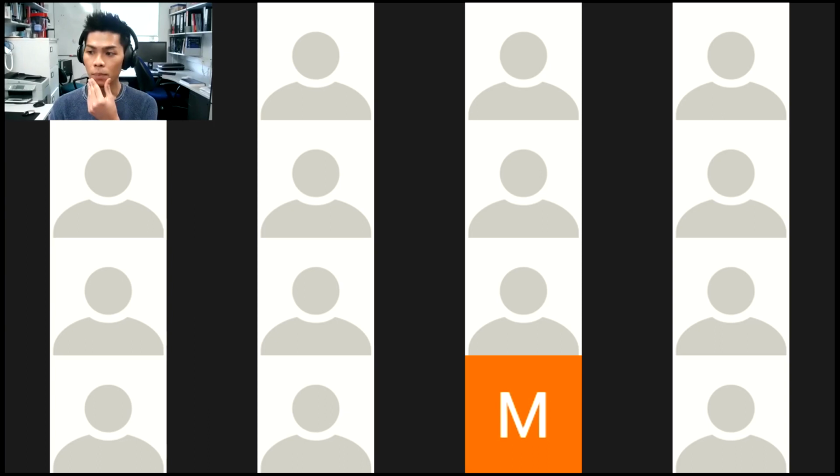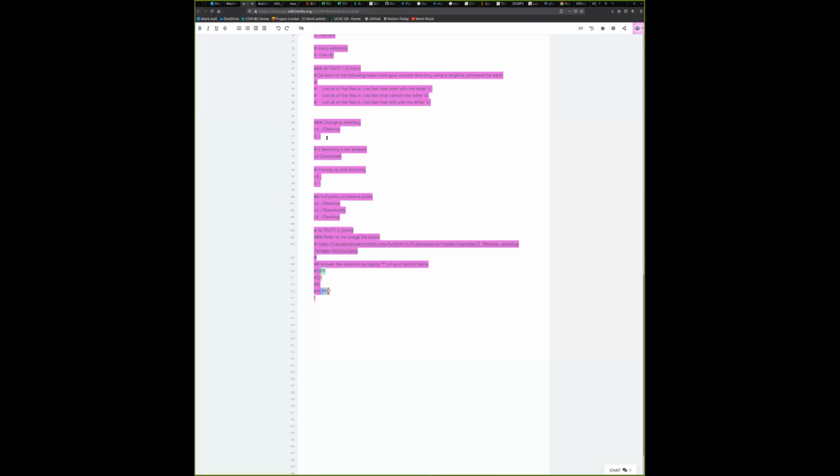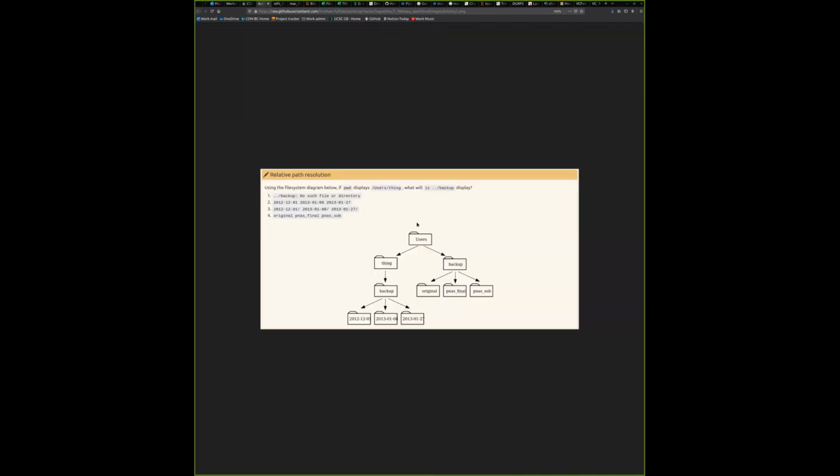Okay, I think we have several inputs. At this moment, I'm going to share my screen. I apologize if, when I'm sharing screen, Zoom suddenly goes to full screen and you have to click close full screen. It happens to me all the time and I get annoyed, so I have to apologize first if it happens. So we do have two major answers, 1 and 4. Let's go through the question and see what the answer is.